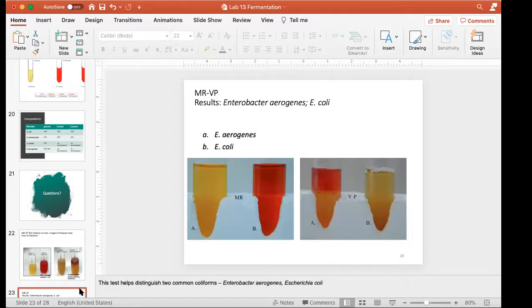All right. I said a few minutes ago that I was holding off on looking at our fifth organism. Remember, our fifth organism today is Enterobacter aerogenes. This is another gram-negative fecal coliform. And we know that Enterobacter and E. coli are both gram-negative rods, both intestinal or fecal organisms, both coliforms. That means they're both able to ferment lactose. So you can imagine that sometimes it would be hard to tell them apart.